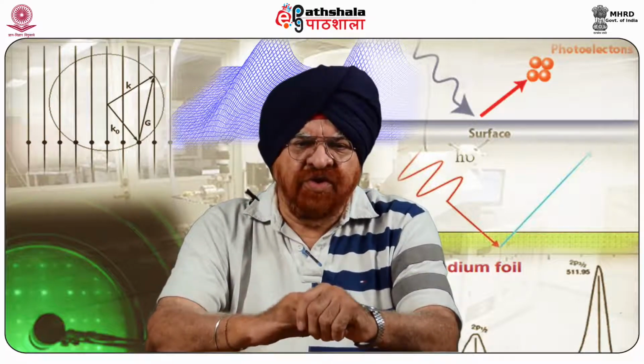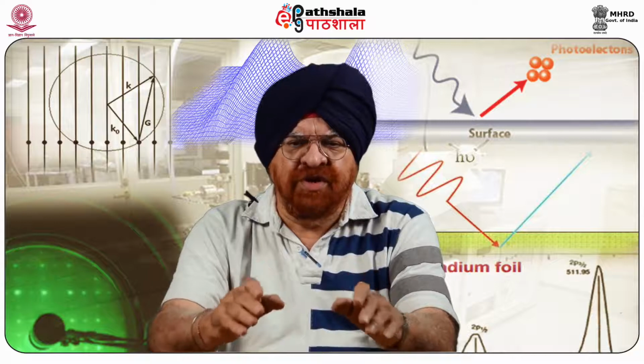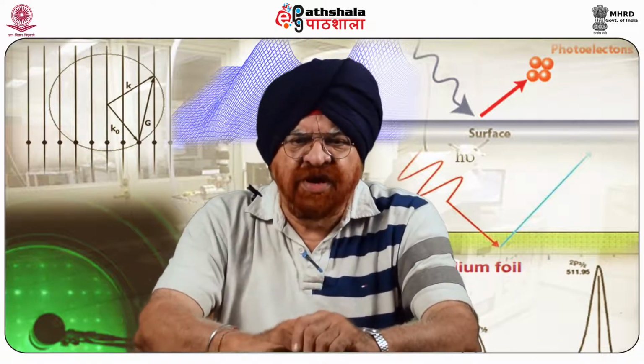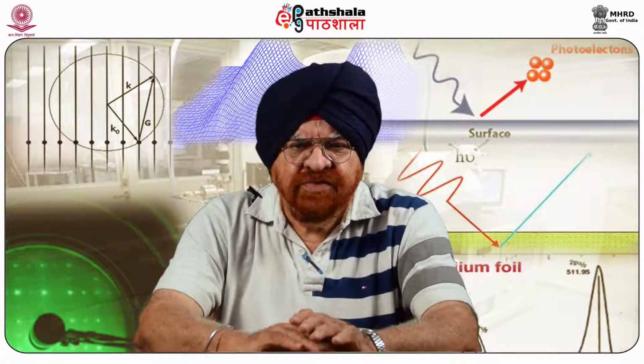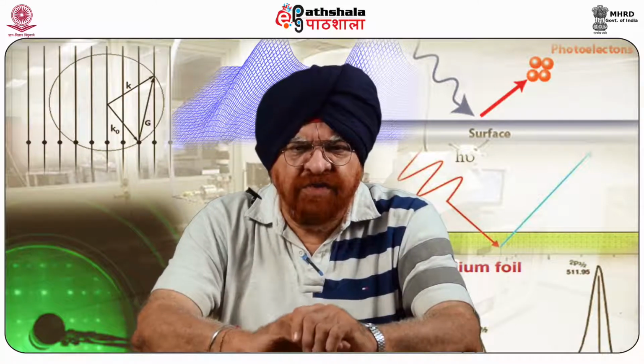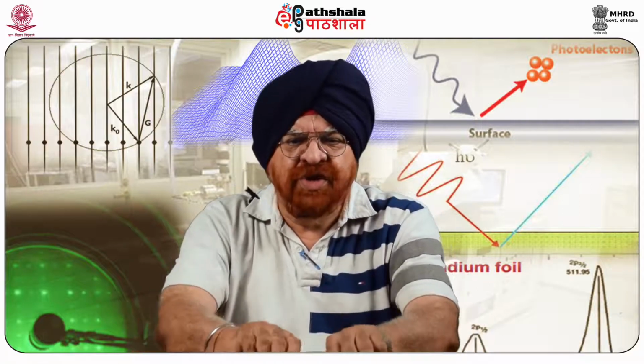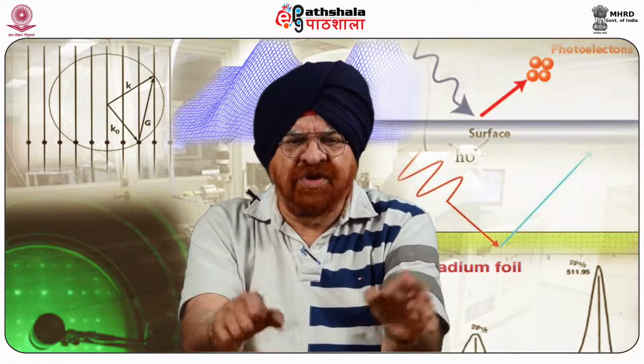KPFM was introduced as a tool to measure the local contact potential difference between a conducting AFM tip and the sample, thereby mapping the work function or surface potential of the sample with high spatial resolution.